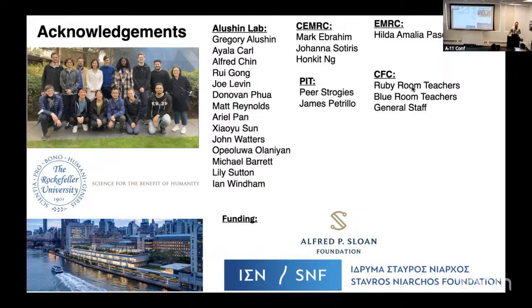Recently, I've moved to 100 mesh hexagons because, especially with high pressure freezing, you're not as worried about movement of the sample because it's a huge solid sample that you coat in platinum. With the plunge frozen, yes, use 200. We don't clip our own grids, the facility does, and I bother them to get them aligned, because there are grid clips with notches.